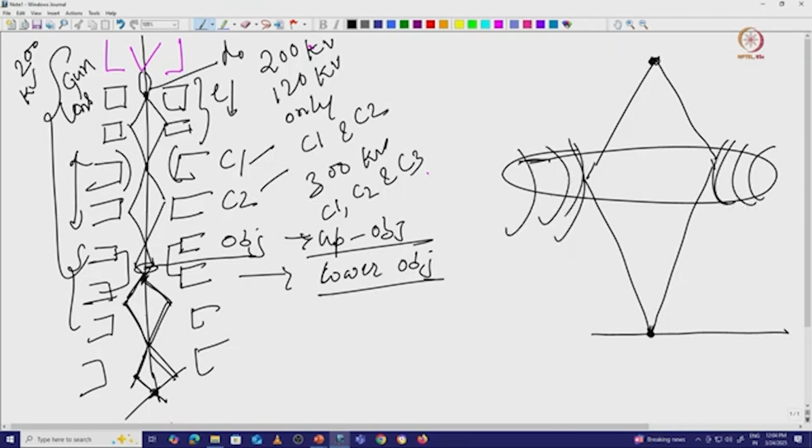If we have a stronger magnetic field, what will happen? The beam may converge somewhere here and go all the way and give a diameter of that beam. It may be possible that it merges in one particular point and gives the same point source, or if we use a different kind of magnetic field, the crossover point will go up and you can get a spread beam.